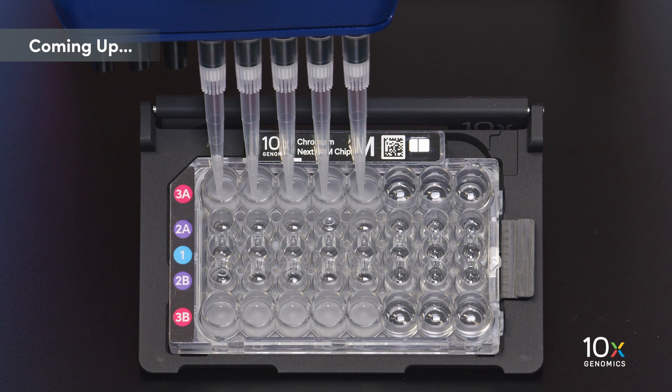After the run is complete, we will take the chip out of the Chromium X and transfer the GEMs into PCR strip tubes.